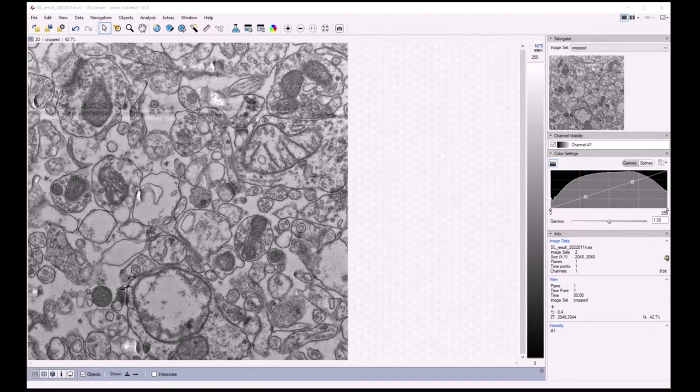I'd like to show you today how to create the 2D annotations in Vision 4D and how to apply the deep learning model in our software. You will see how we can do this without any knowledge in scripting. Let's start in Vision 4D.